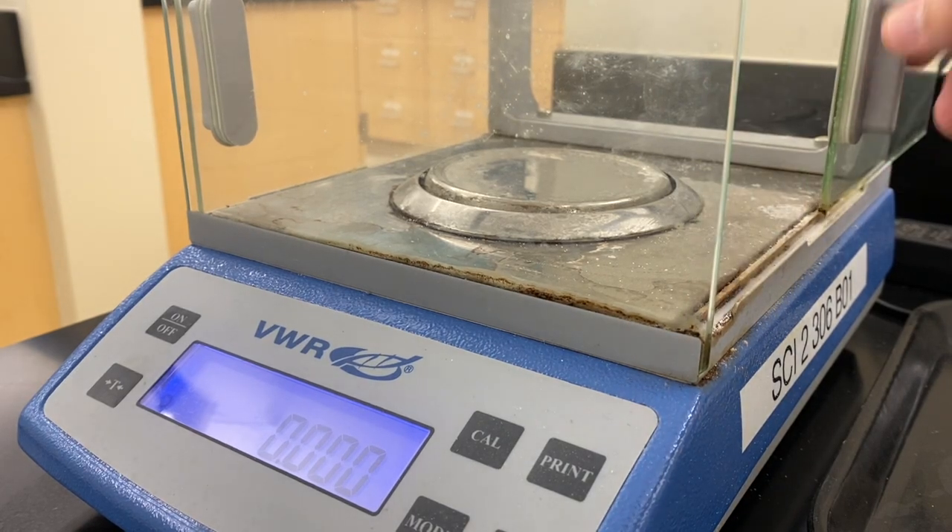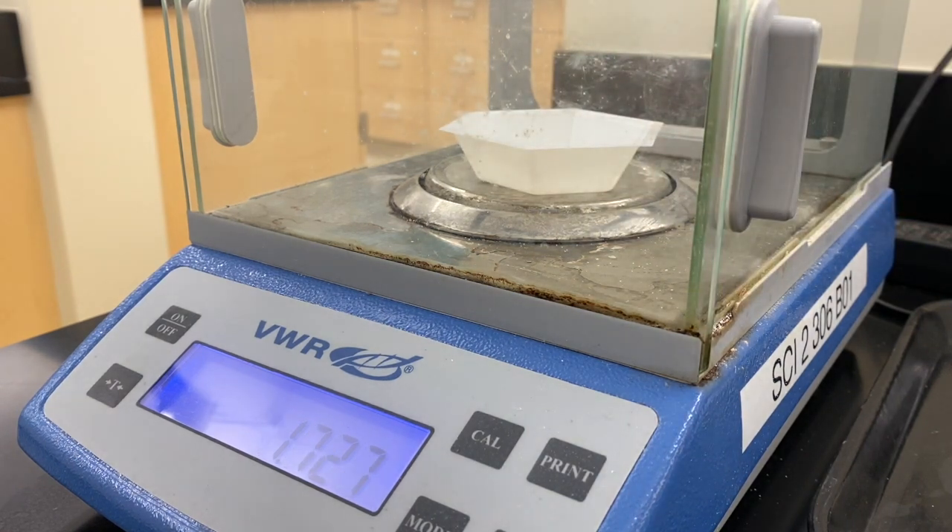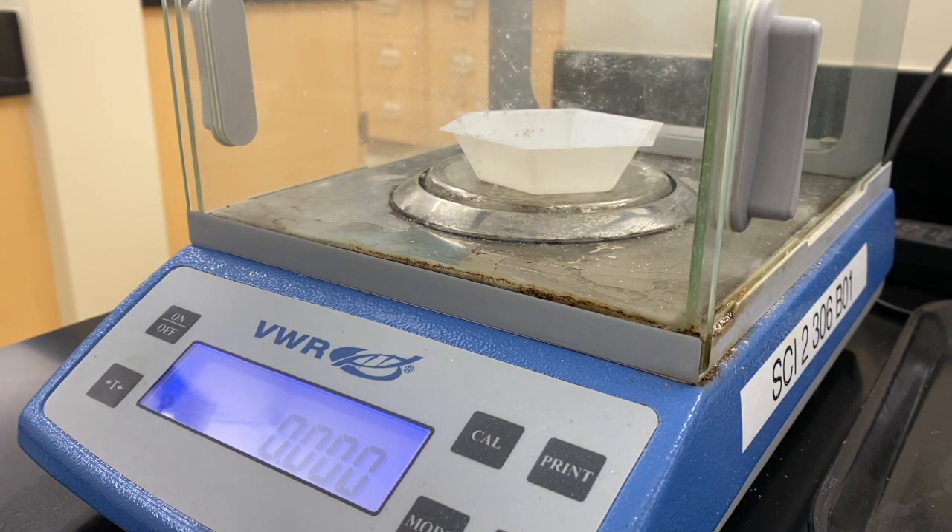The first thing we have to do is weigh out our 3-nitrophthalic acid. We have a weigh boat, we're going to hit the tare button to get rid of that mass, and we're going to weigh out a gram of our material.